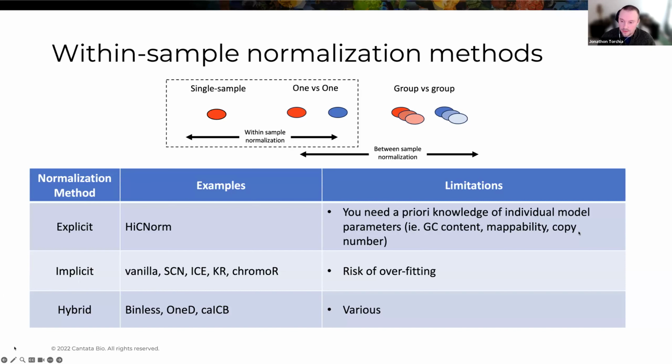In particular cases where you have really complex copy numbers, or if you don't know the ploidy of your genome, for example, that assumption can sometimes not be appropriate. Or if you do a capture experiment where you're only capturing certain parts of the genome, these implicit equal coverage type normalization procedures aren't always appropriate.